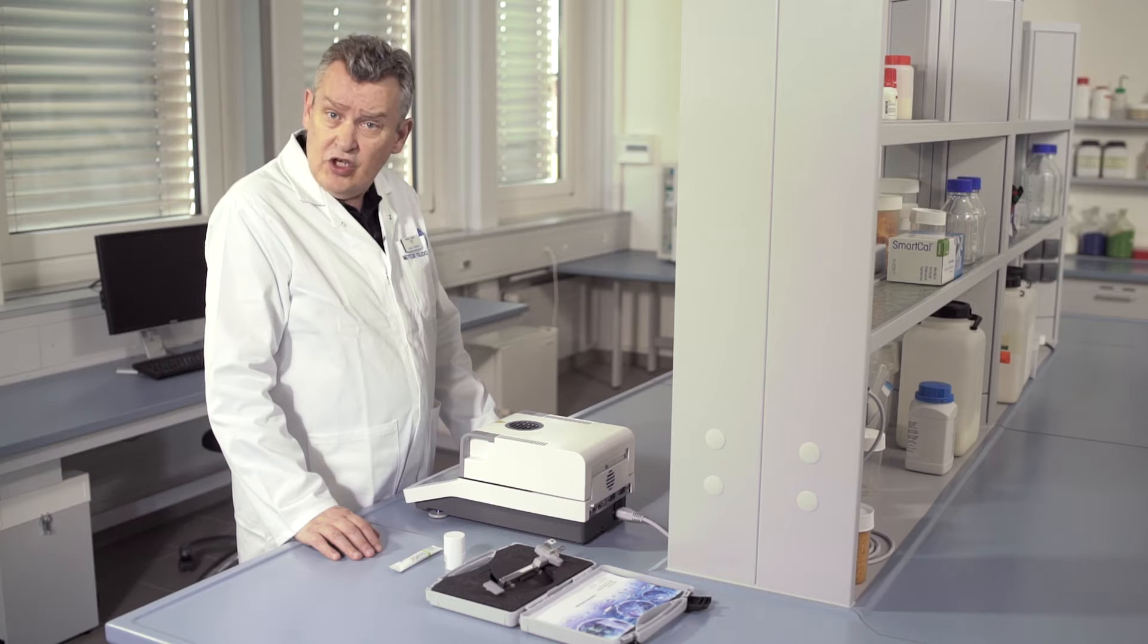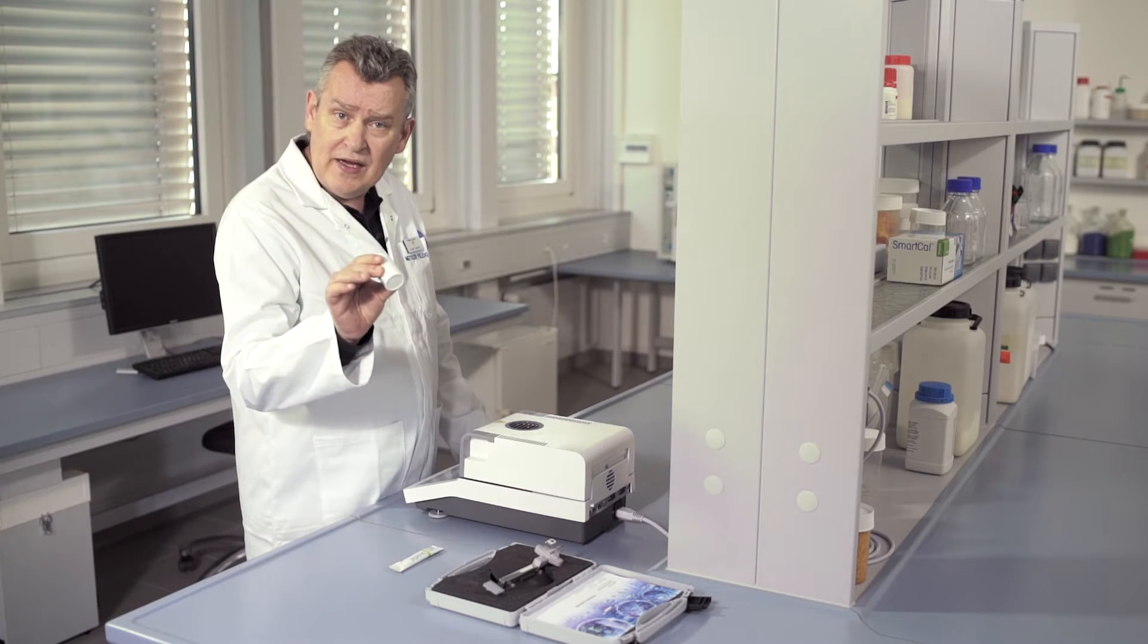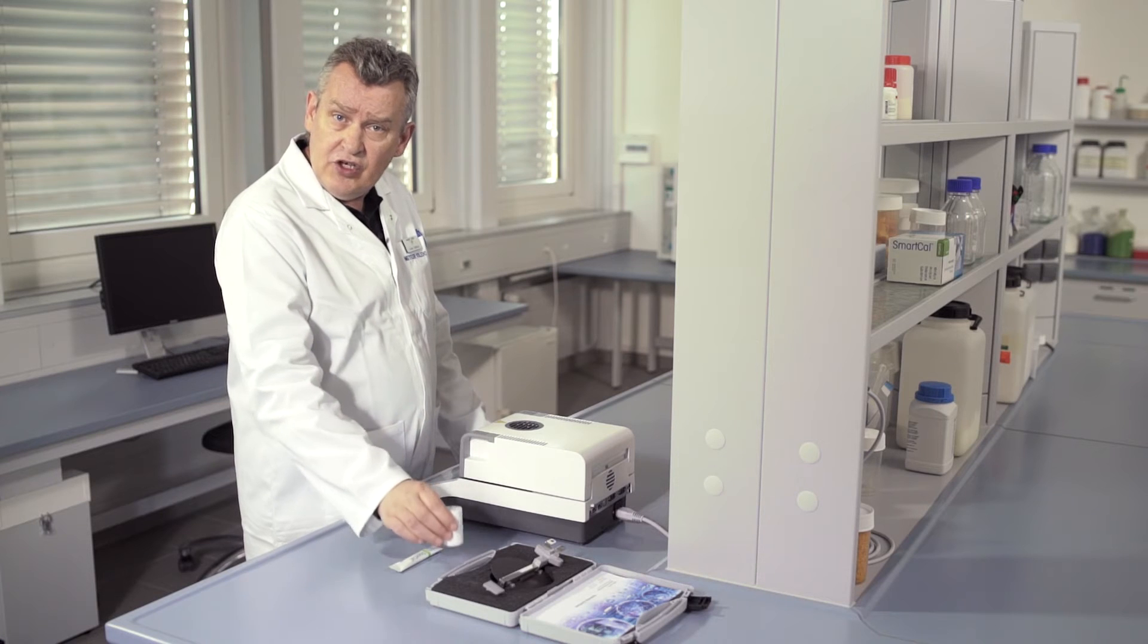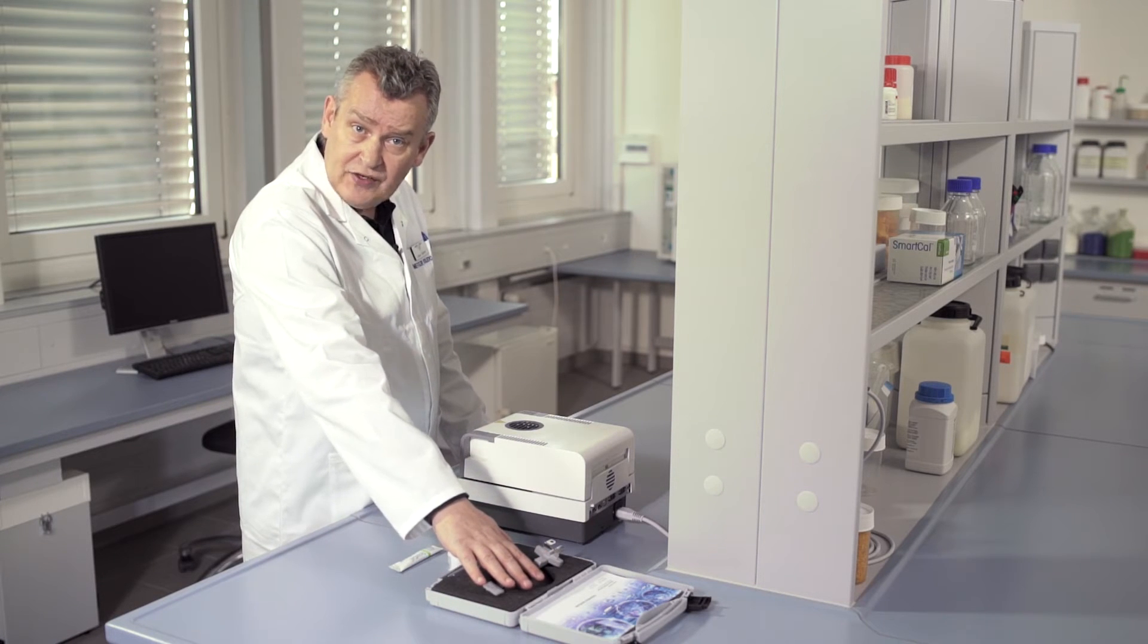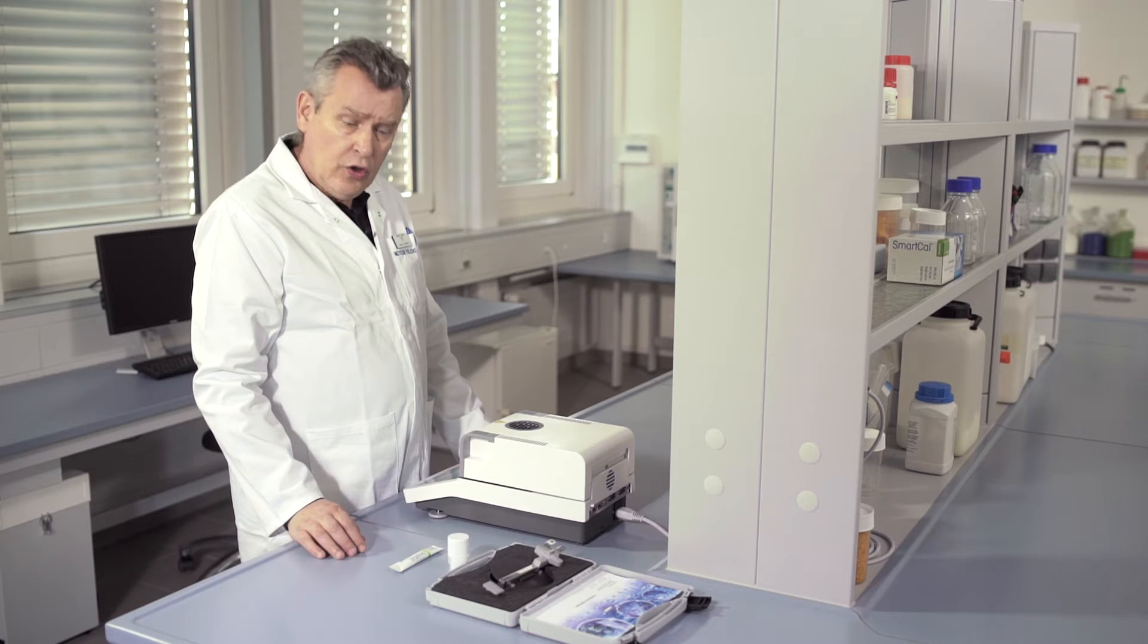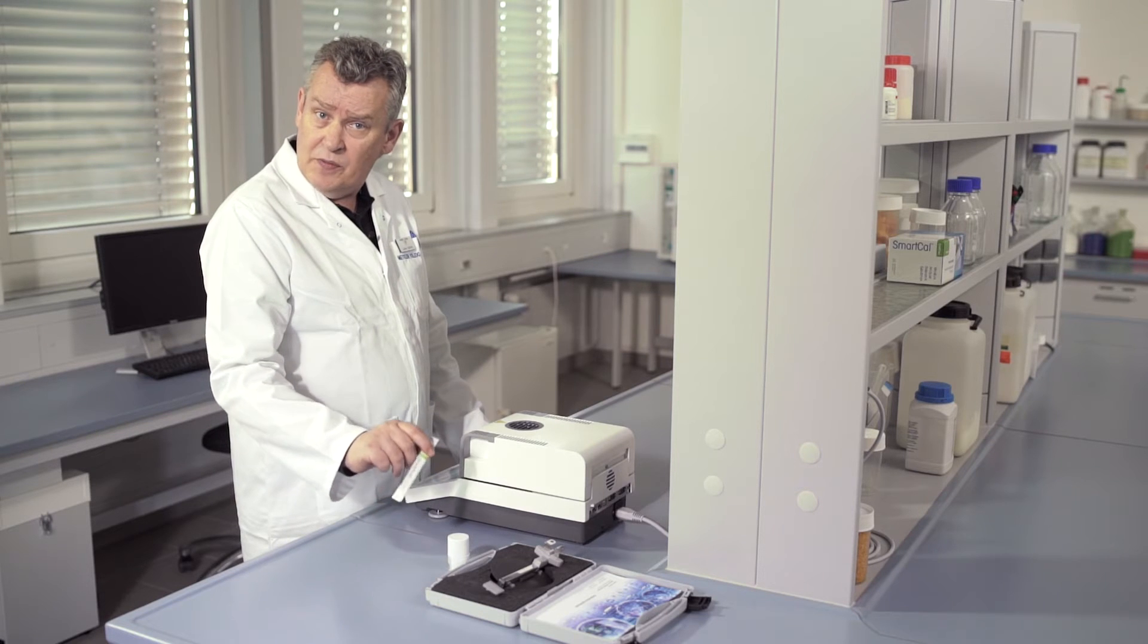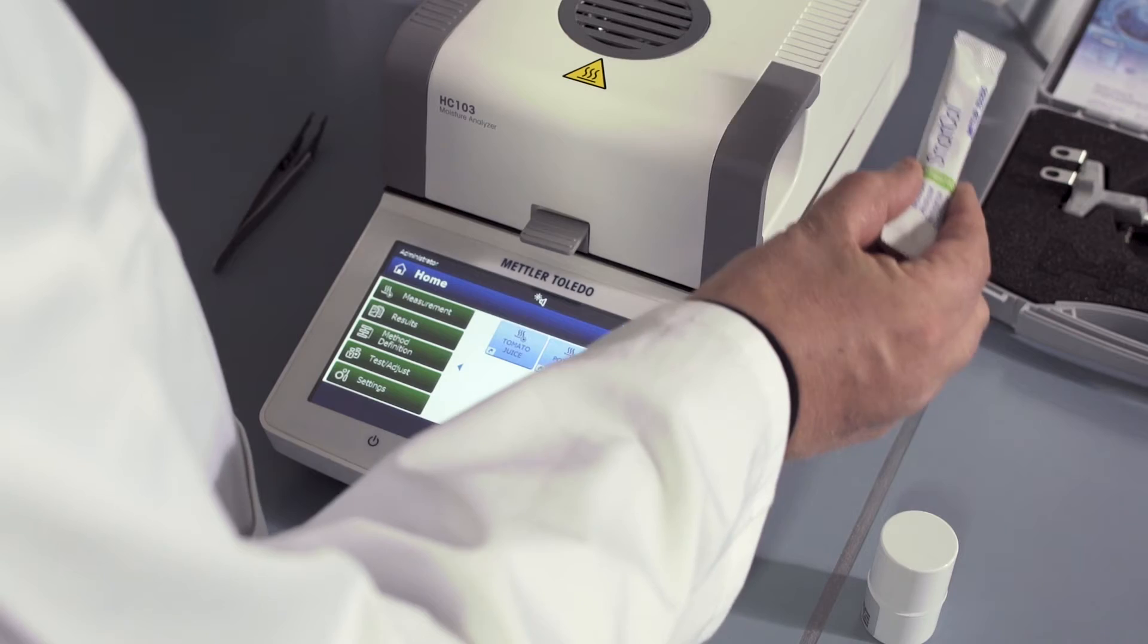Test and adjust the weighing unit using a calibrated weight and test and adjust the heating unit using the optional electronic temperature calibration kit. Furthermore, you can perform a holistic instrument test using Smart Cal. This is a quick and easy test to verify the overall performance of your halogen moisture analyzer.